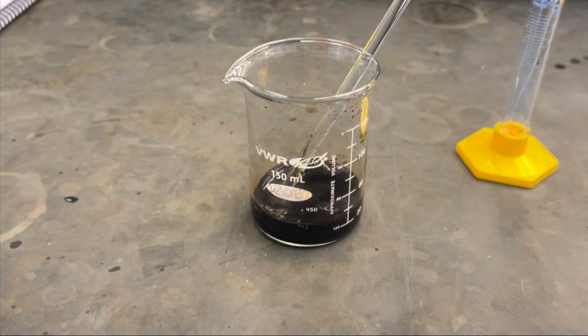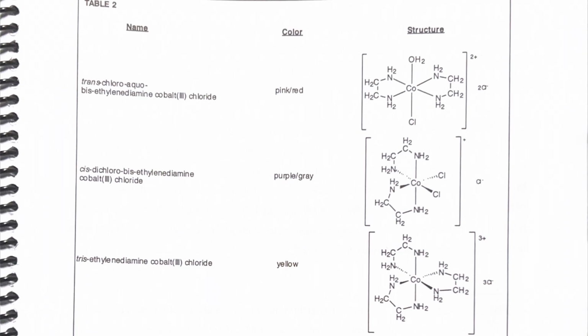First, we will be preparing the reaction mixture. It is crucial to mix the reagents in the correct order and amounts or else side products will form. Refer to Table 2 in Lab Manual.